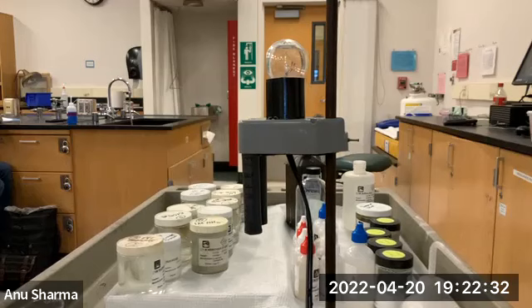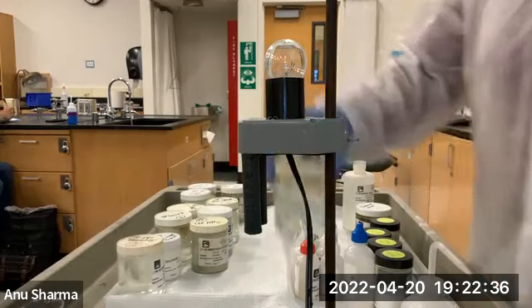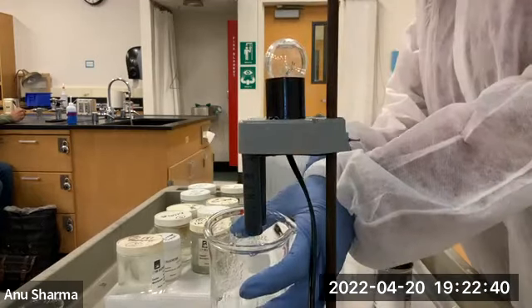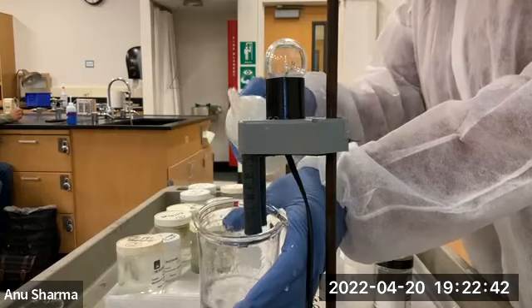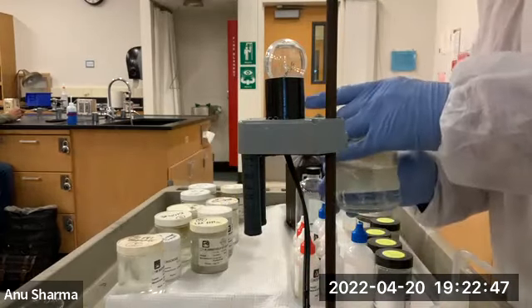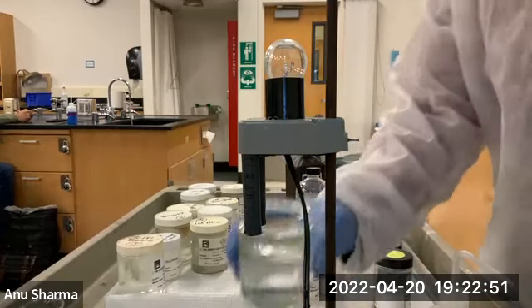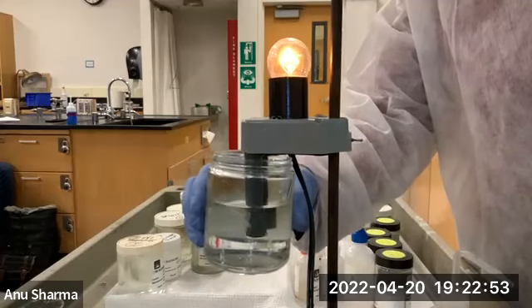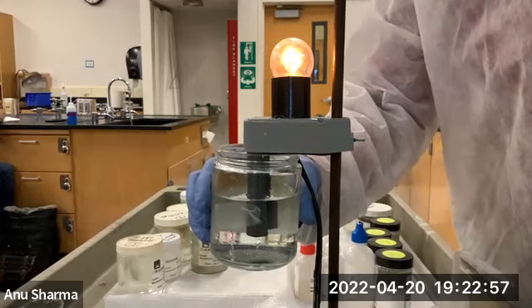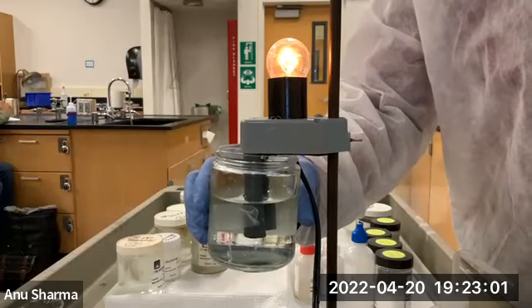Acetic acid. Now, acetic acid is vinegar, okay? Acetic acid is vinegar, and let me just wash this so we know. So remember, we talked about acetic acid. Now remember the glow of HCl versus the glow of acetic acid. Acetic acid is also going to release hydrogen ions. But look at this. So you see, it's very dim in comparison to HCl. So it's a weak electrolyte.